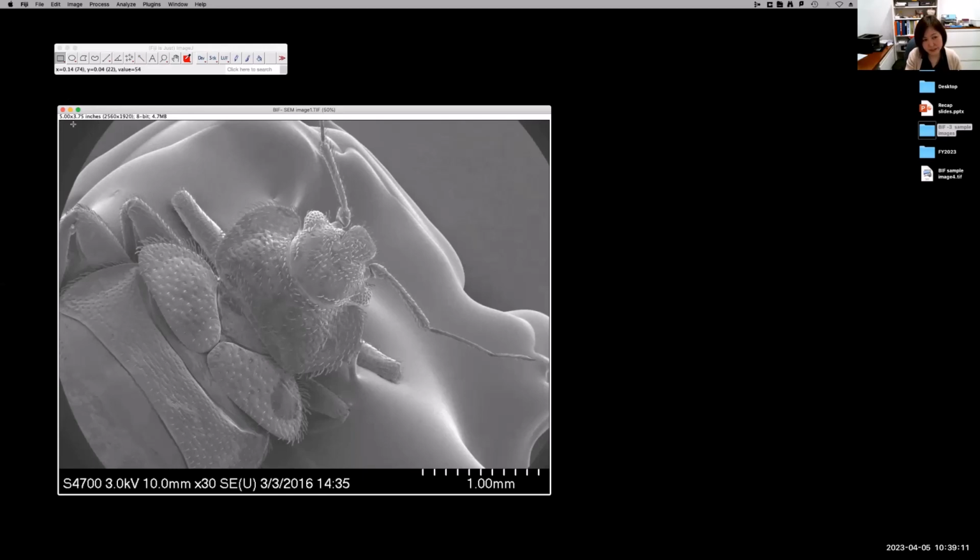It follows the default setting of the ImageJ software, and we have to change it. The bracket shows how many pixels make up this image. And here is the bit information. This image is 8-bit, so it has 256 variations. And lastly, this is the size of this image file.